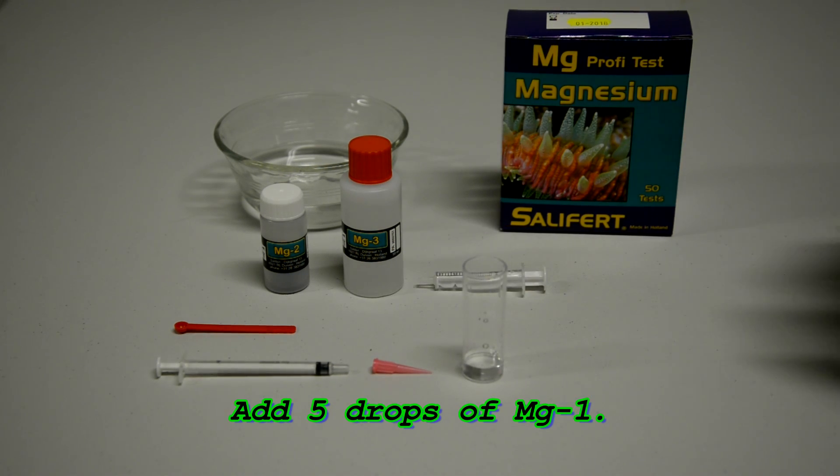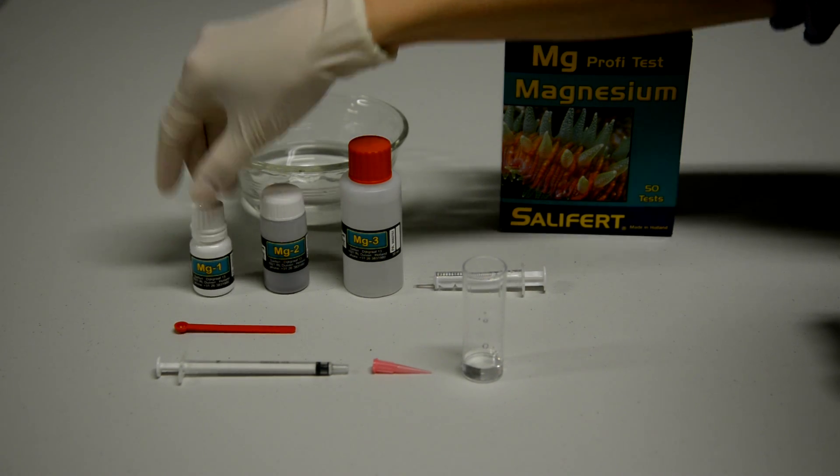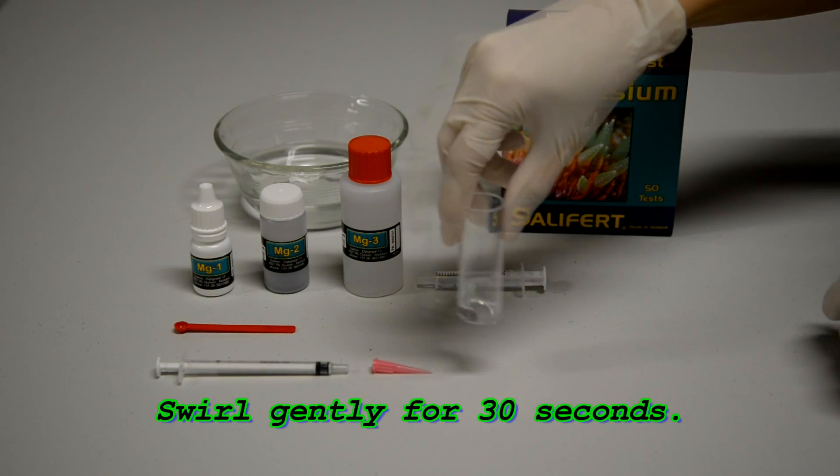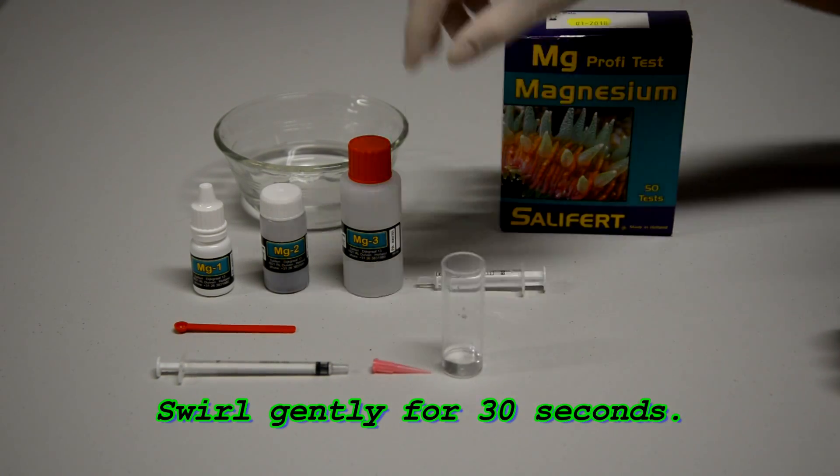Then we're going to have to swirl it gently for about 30 seconds just to make sure everything is mixed and ready to go.